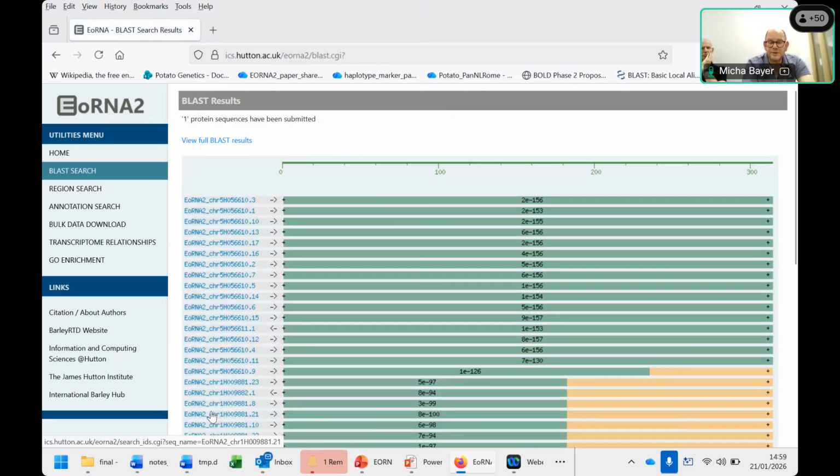What it generates is quite valuable in itself. Here it shows the different transcripts for this gene, which matches best with your gene. That is a good thing. But if you look further down, there are also other matches. There's a good match with the 5' end, or the N-terminal sequence of the peptide.